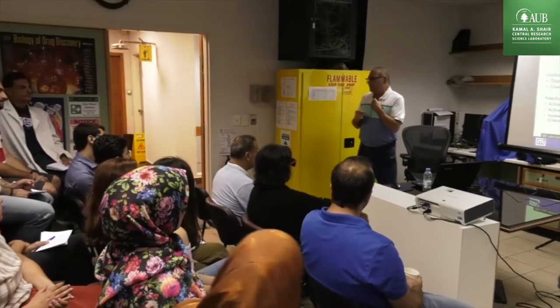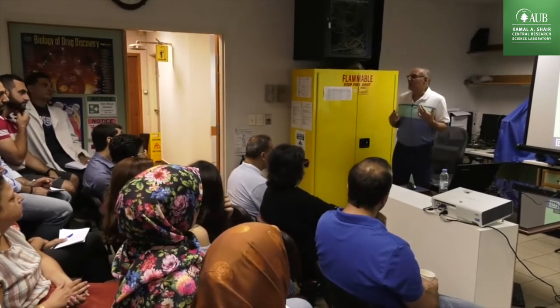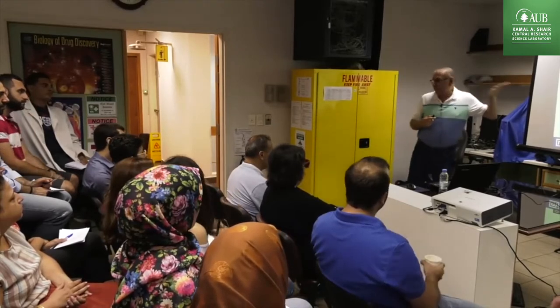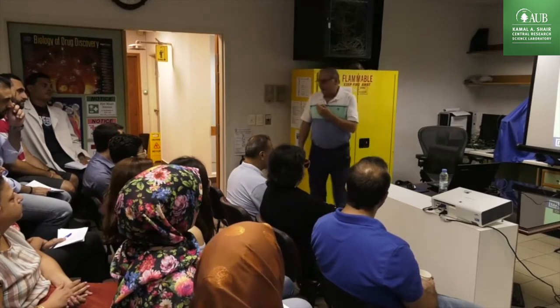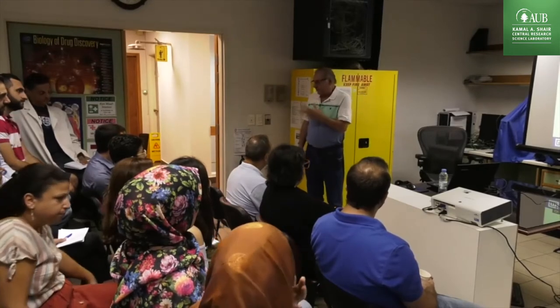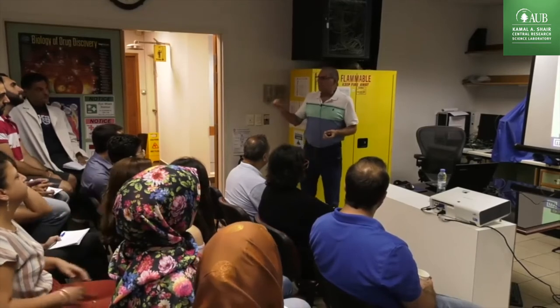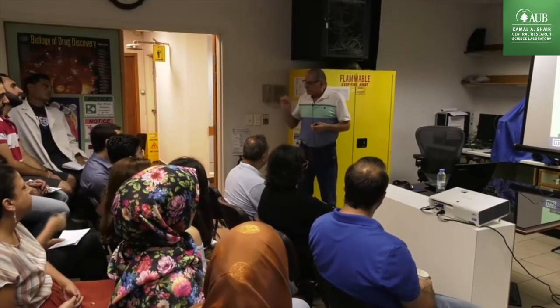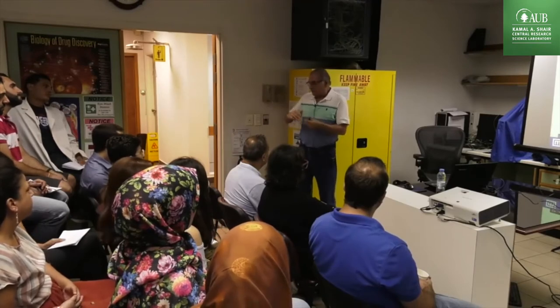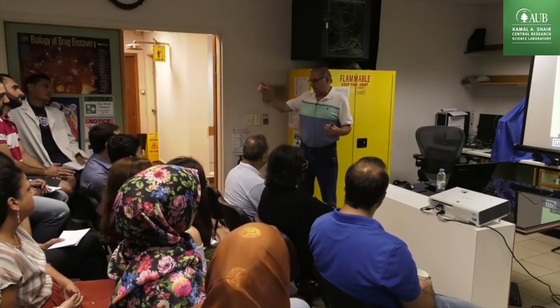Okay? Not significant. We don't care too much about it, because what we do care about is the total. But if you like to do a real refining of the analysis, you're a student, you like to see exactly what's going on, then you can dose a very small amount, maybe 0.2 cc per gram of gas, very slowly, and see how it adsorbs. And you expand the adsorption isotherm, maybe you can get 100 points, so you can see maybe like this, okay?